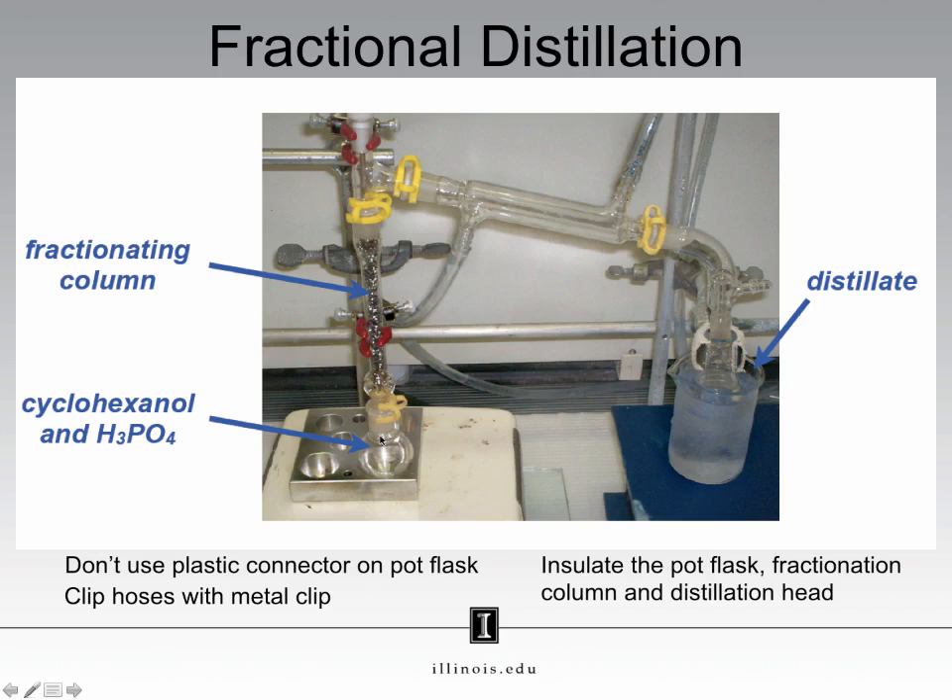However, as your vapor travels up, it will cool down. If it cools down too much, it will condense in the column and then drip back down into the round bottom flask. To keep the vapor from cooling too quickly, you will coat the column and the round bottom flask in aluminum foil.